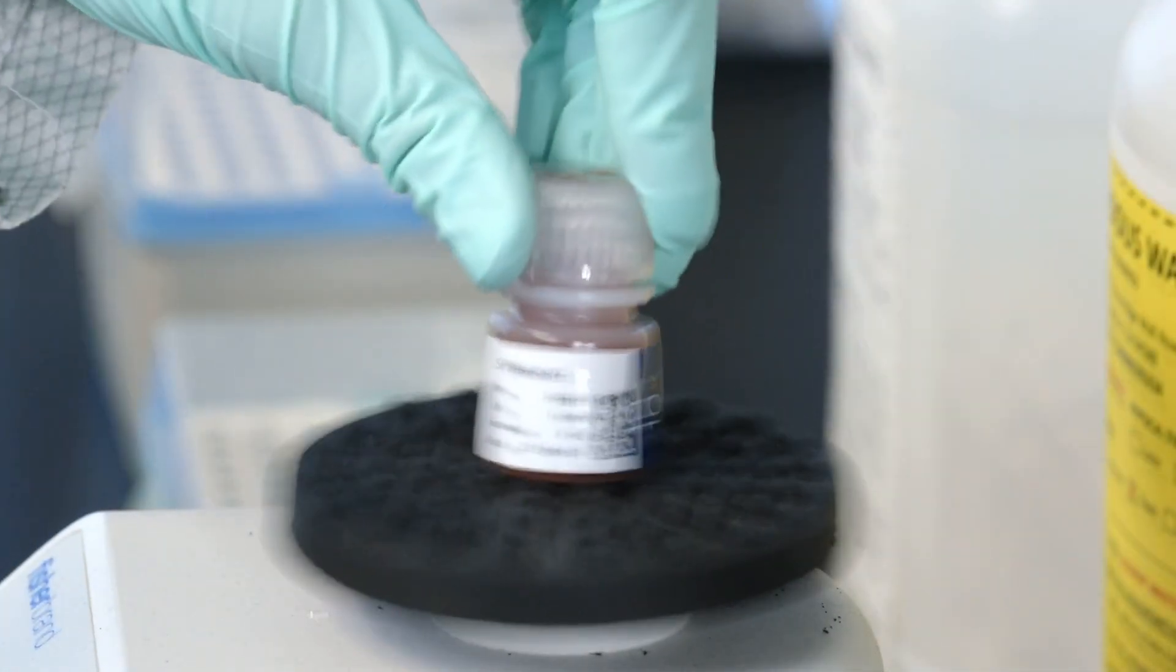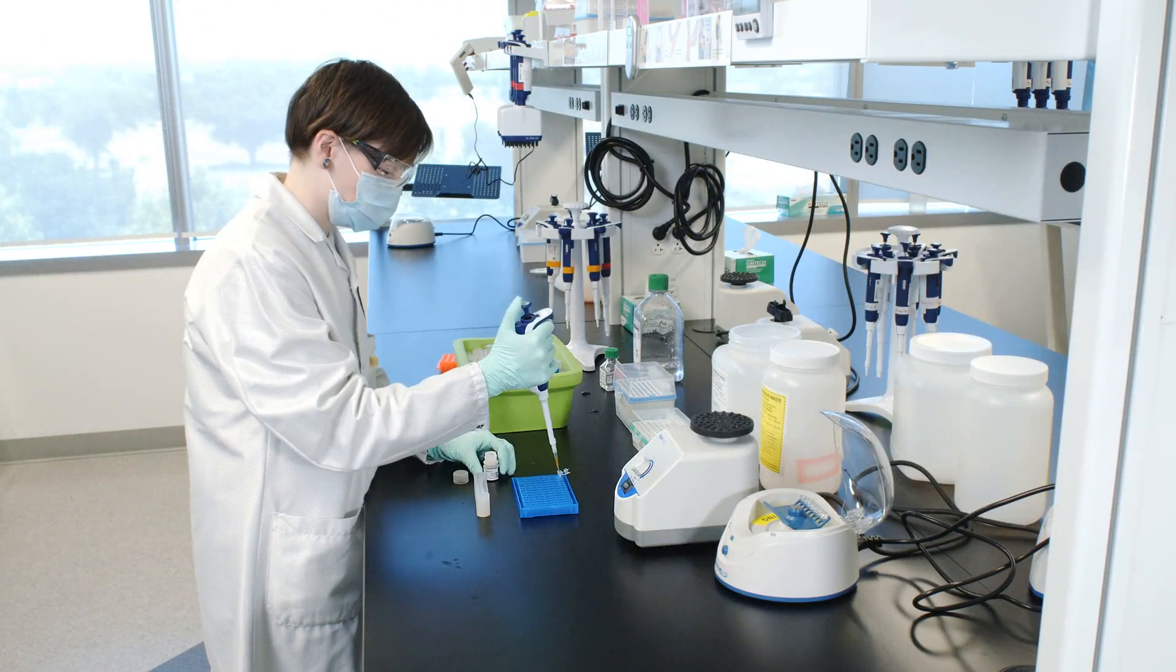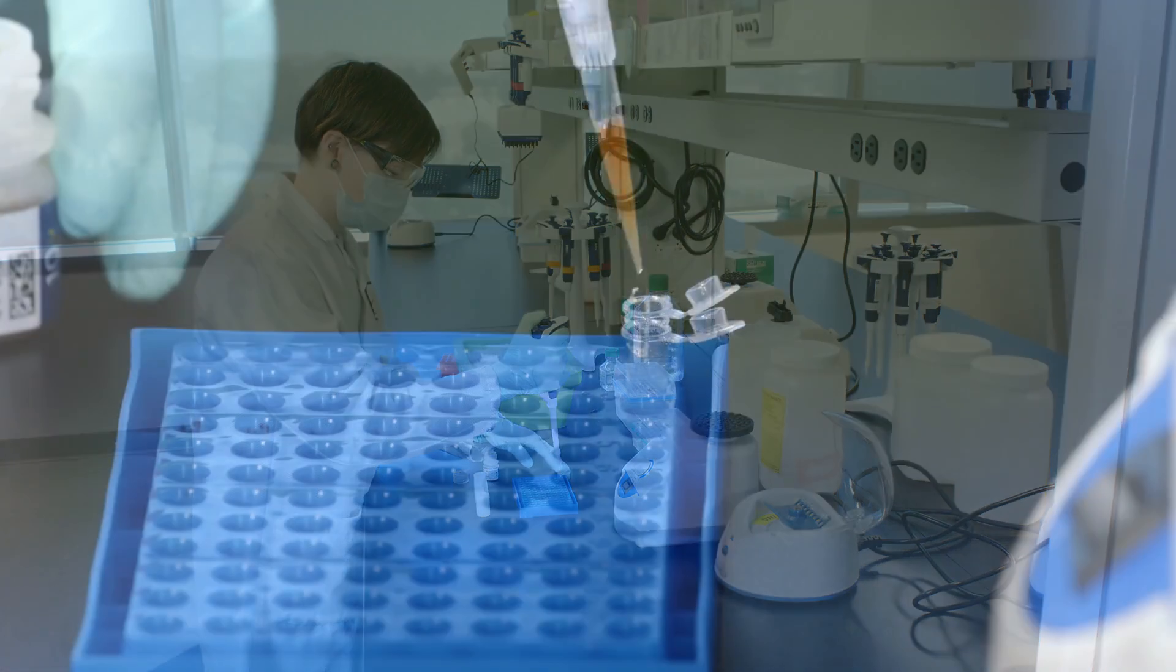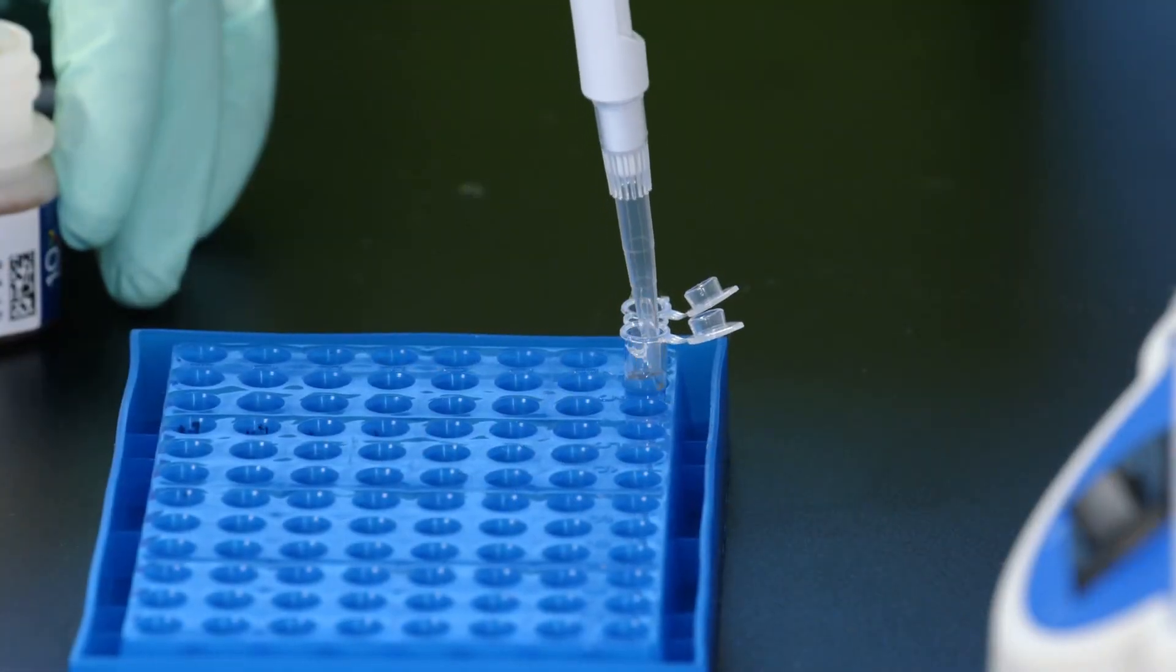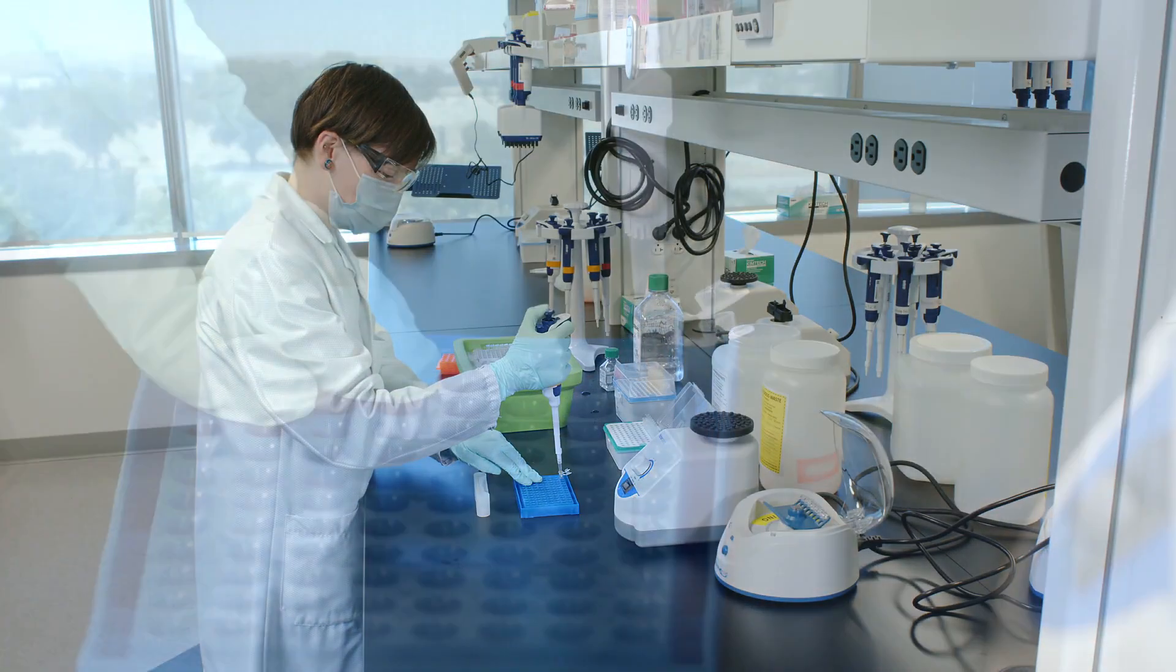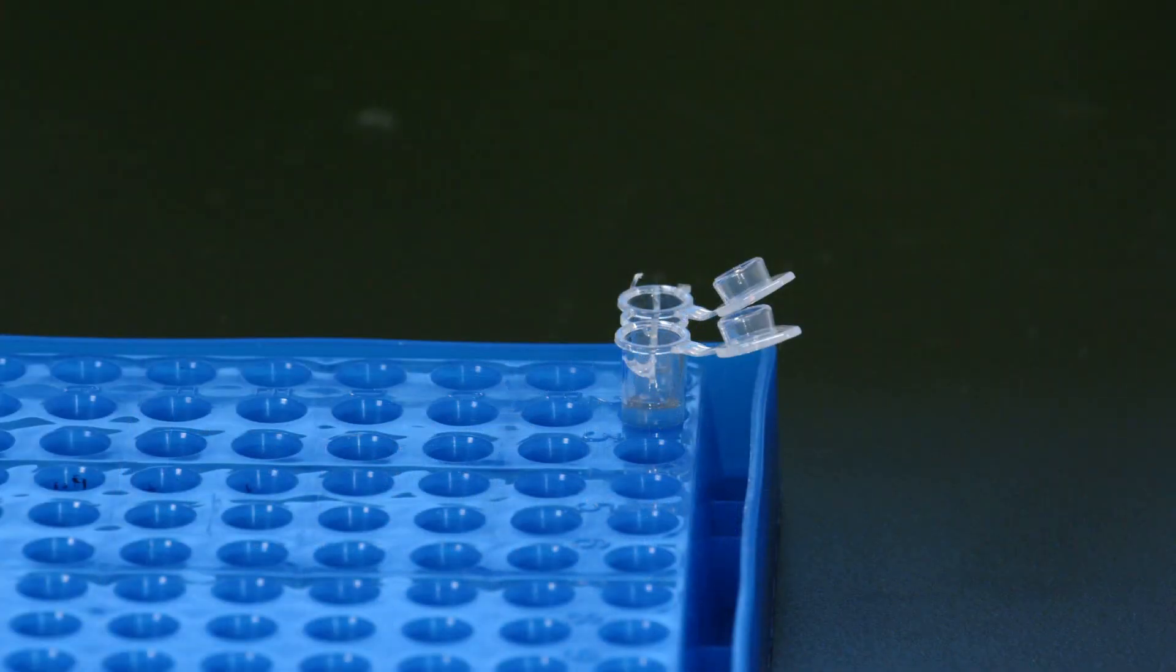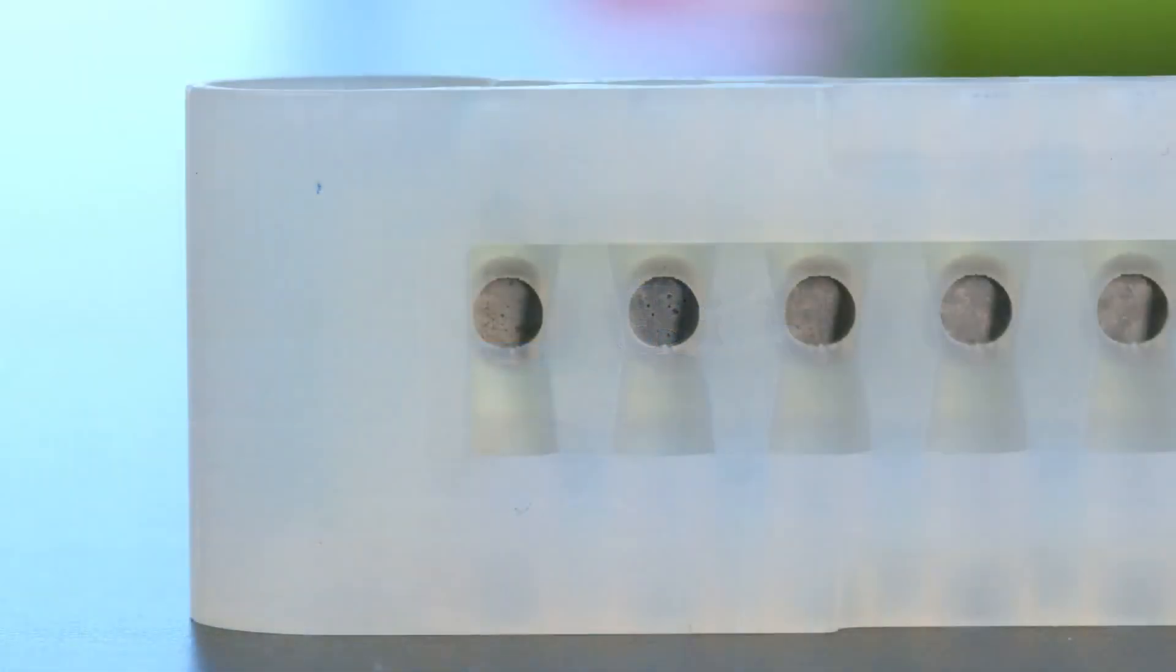Vortex to resuspend the SPRI select reagent. Add 85 microliters of SPRI select reagent to each sample. Pipette mix 15 times with the pipette set to 175 microliters. Incubate at room temperature for 5 minutes. Place on the magnet in the high position until the solution clears.